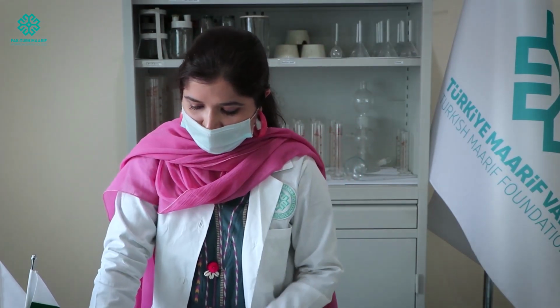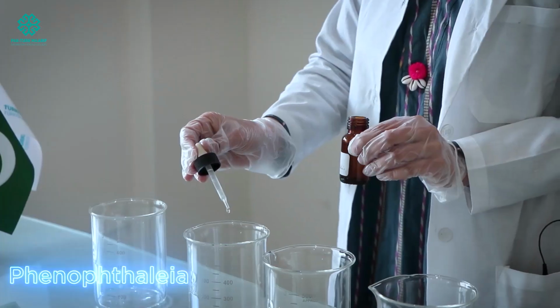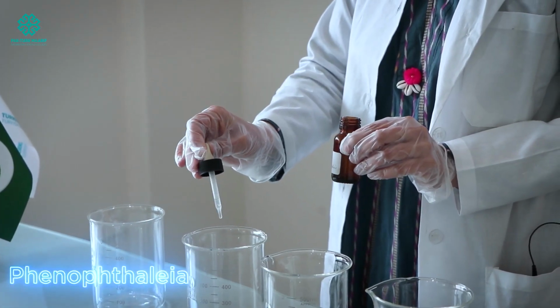Now why is it happening? Actually, I transferred the solution into beaker 2, which is filled with a few drops of phenolphthalein, and phenolphthalein is the indicator. So the color you can see in this beaker is the color of phenolphthalein.